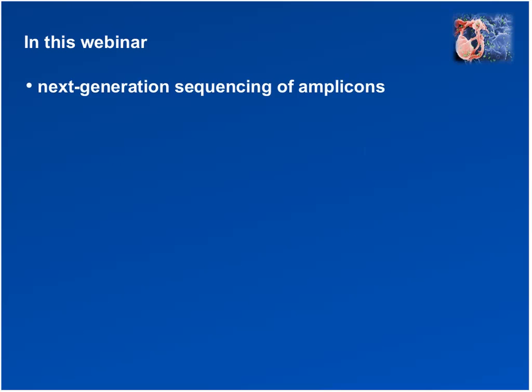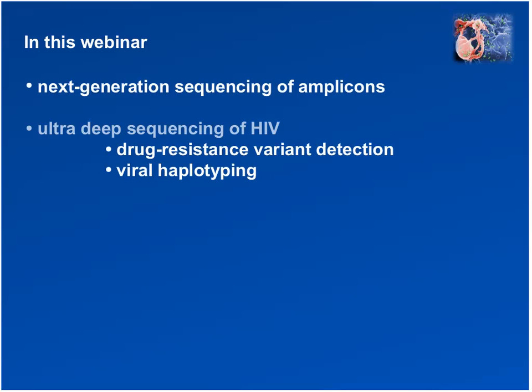In addition, this webinar will be of interest to those of you who are interested in sequencing HIV in particular, and of course, particularly as it pertains to the detection of minority drug-resistant variants and viral haplotyping. By viral haplotyping, I mean the identification of populations of virus based on unique signatures of the variants. This latter approach requires long-read sequencing.